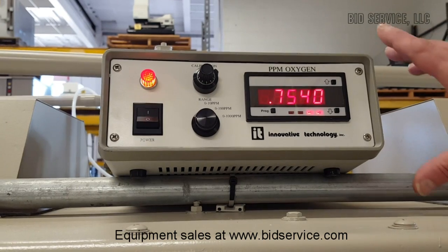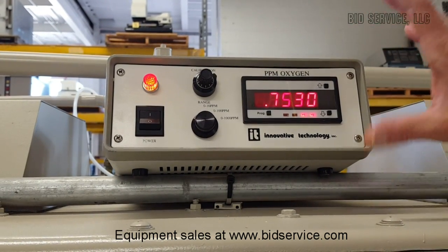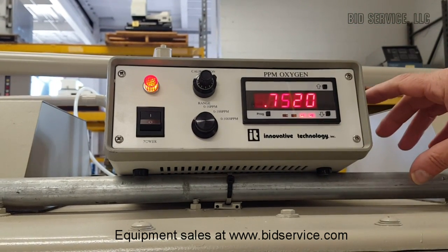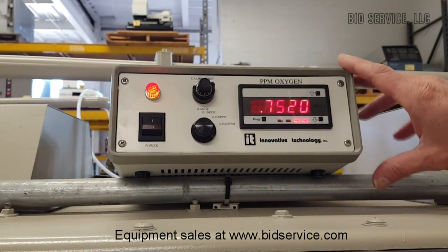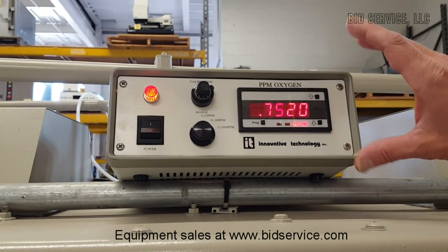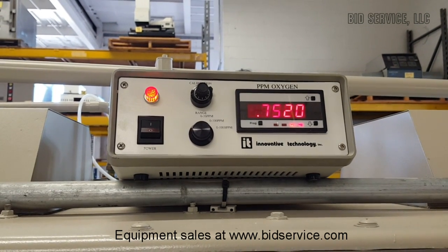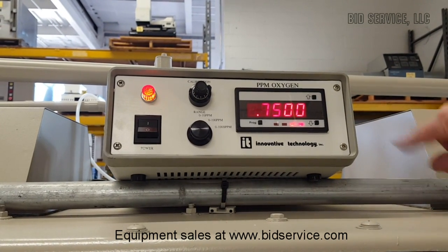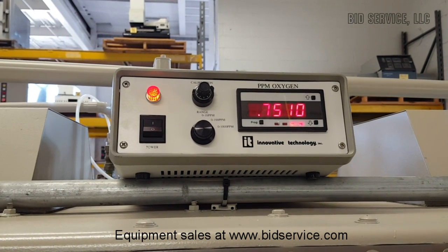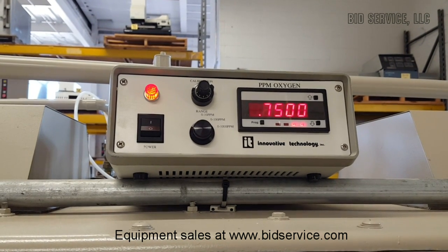This is our house monitoring oxygen parts-per-million sample system. Right now we're at 0.752, which is less than the 1 ppm of oxygen required for the system. It's sampling through one of the ports on the back, pulled out by the vacuum pump down here. We just use this to verify that the system is working properly.